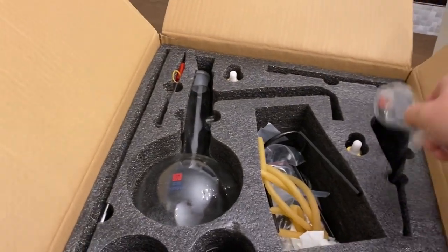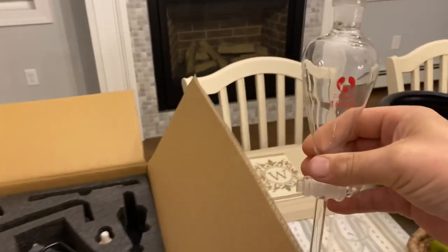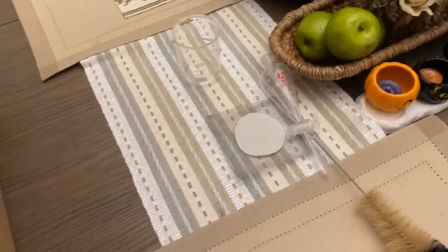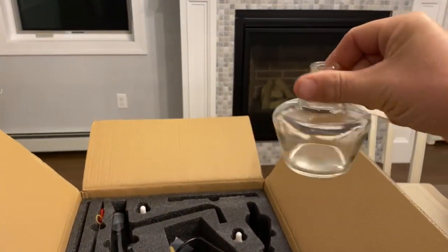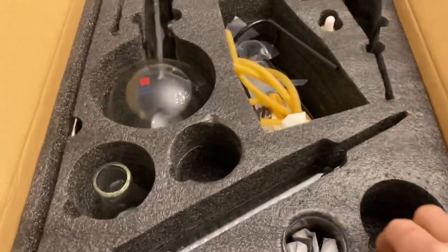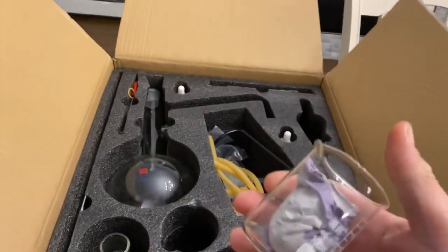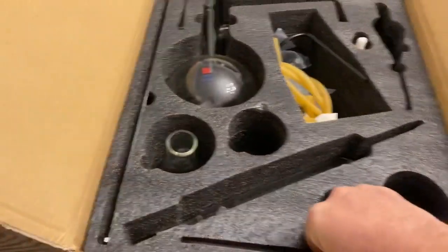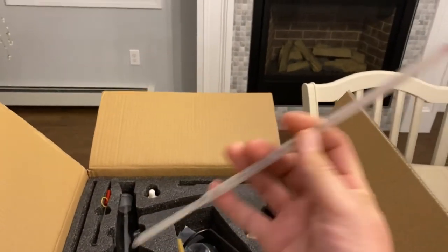This here is an oil separator — it separates the oil and the water. It has a glass valve on it, a very nice piece. This is a cleaning brush, and this here is a lamp oil holder which you'll use as your burner. There's another glass vial, and you've got a hydrometer — it's glass, set in a plastic sleeve.